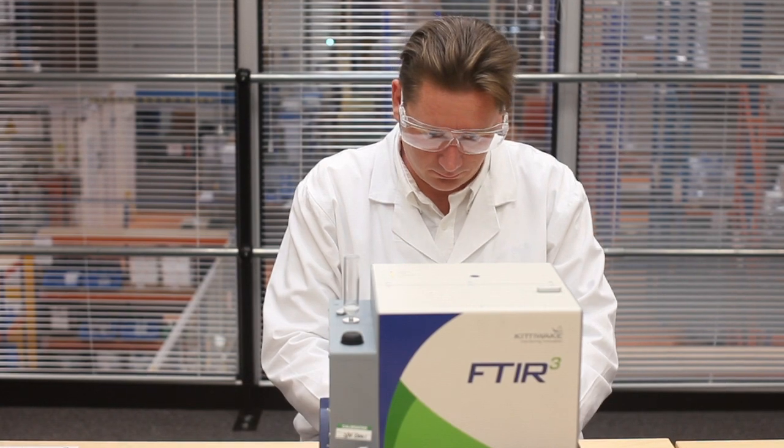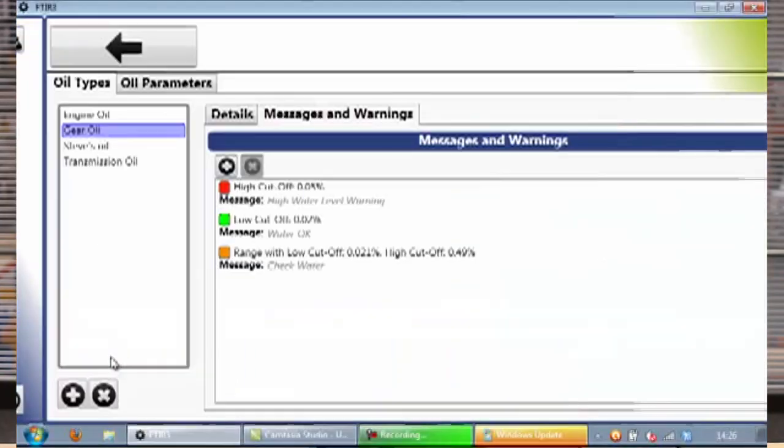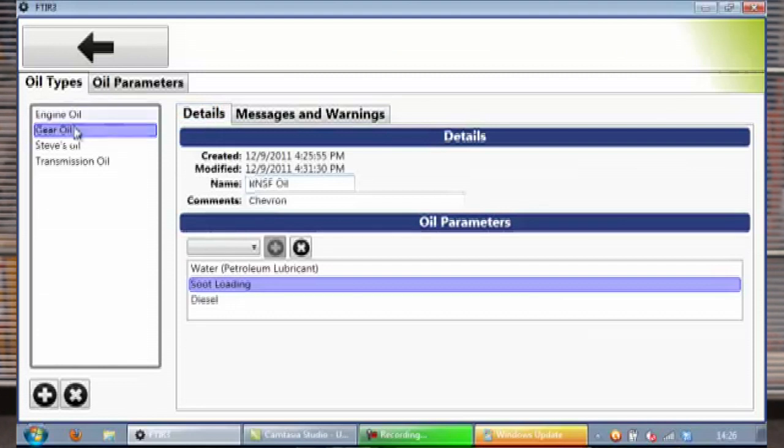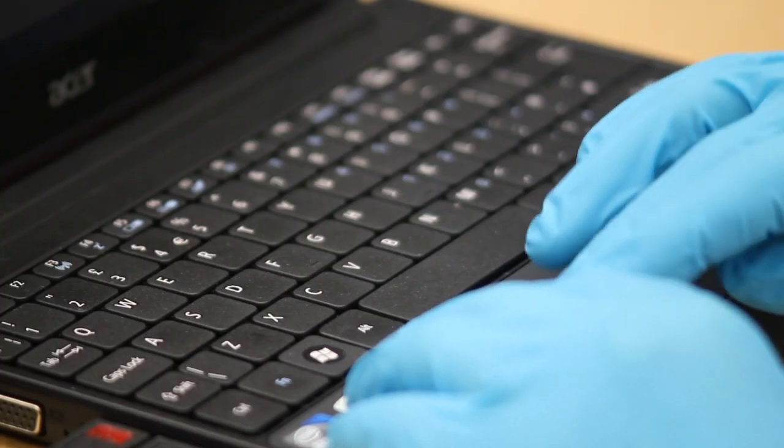Kittiwake's new field deployable ASTM compliant FTIR oil analyzer, the FTIR Cubed, allows easy testing of in-service oils in the field.